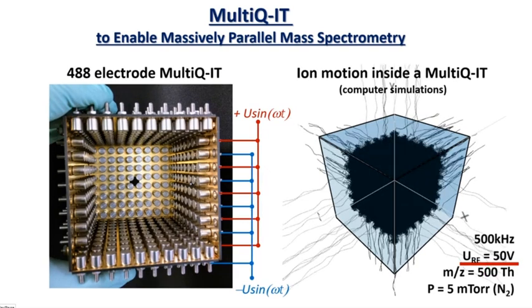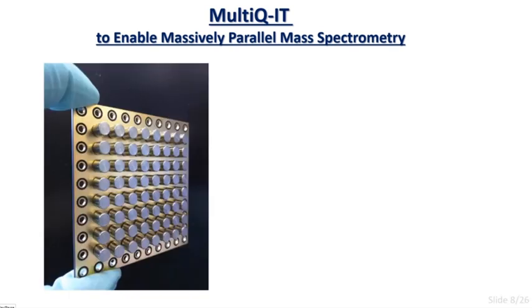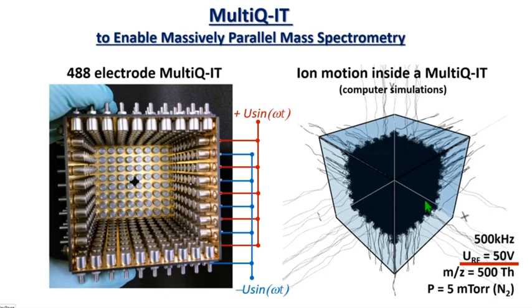The ion will thermalize quickly and then will migrate along the volume slowly. It will occupy a bigger volume. And eventually, it might find a space between the quadrupoles suitable for it to visit, because it will have a stable trajectory there. And if it continues moving, it may exit the device. That creates a multitude of inputs and outputs for ions to enter and exit the device, and actually produces the basis for parallelization.